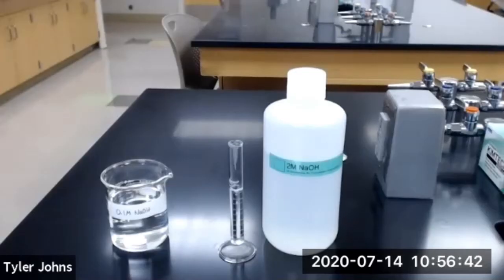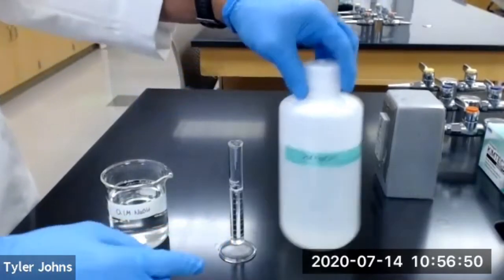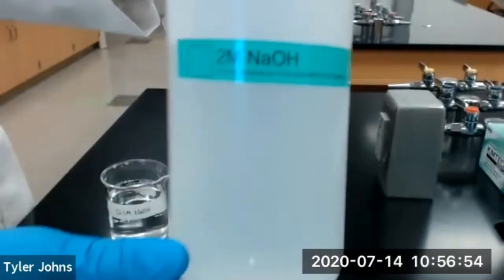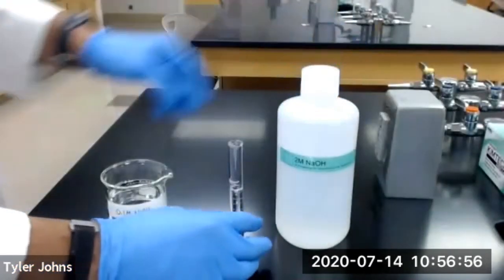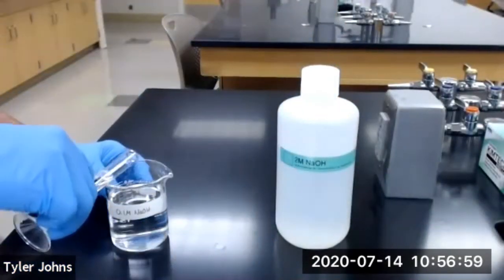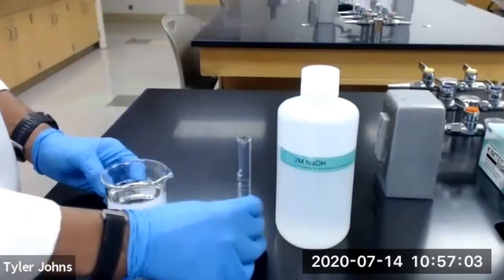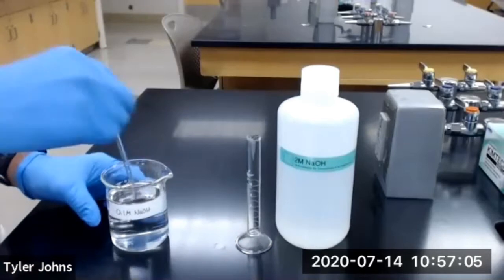We first need to prepare 200 milliliters of a 0.1 molar sodium hydroxide working solution. We're going to take 10 milliliters of our 2 molar stock sodium hydroxide solution and add it to approximately 190 milliliters of deionized water and stir to mix.